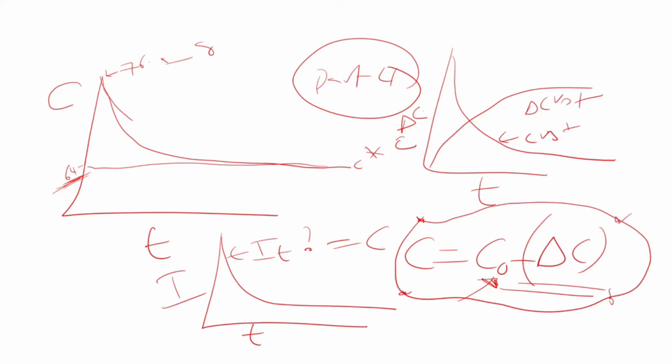These are very simple mass balance equations, but it's a very easy way to convert your intensity into concentration. You cannot find these expressions in the textbook or literature. I don't want to say I developed it, but this is something I figured out, to convert your intensity into concentration using a simple formula. So this may be tricky for you.